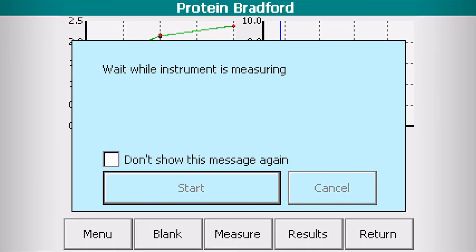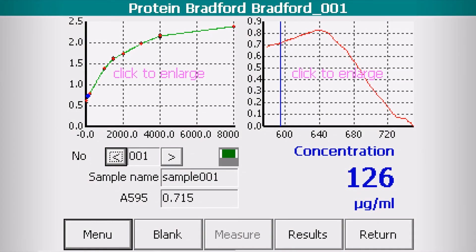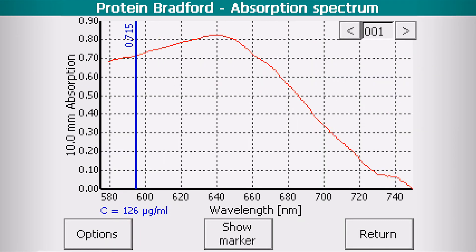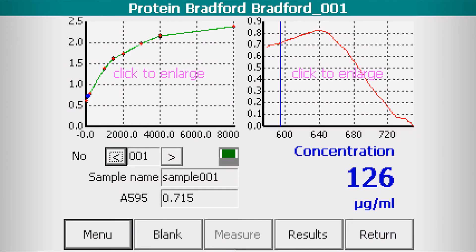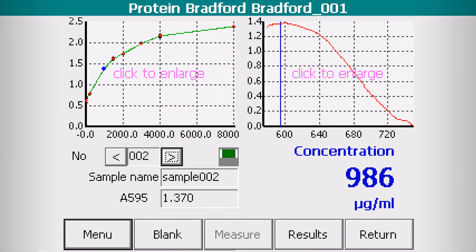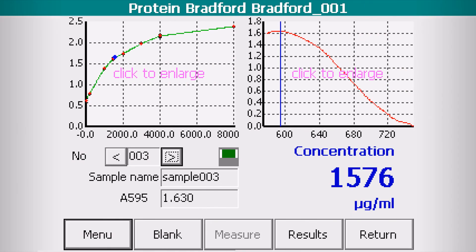Click Start and wait for the measurement to be completed. See the concentration of your sample. You may view the spectra in full screen.